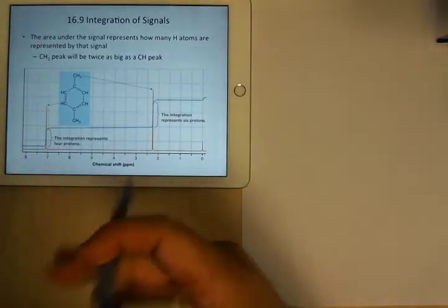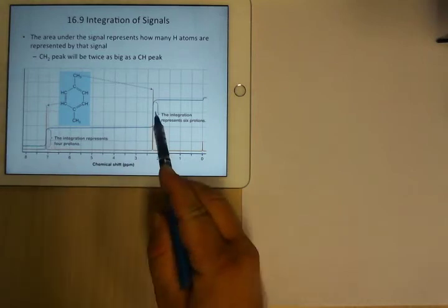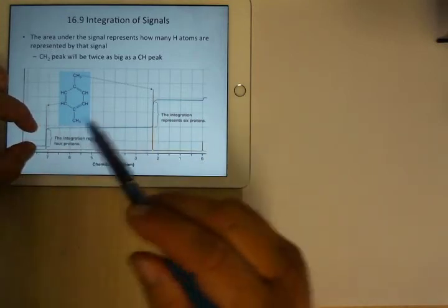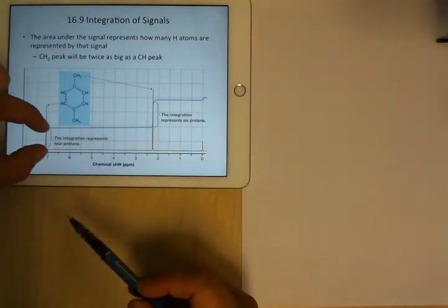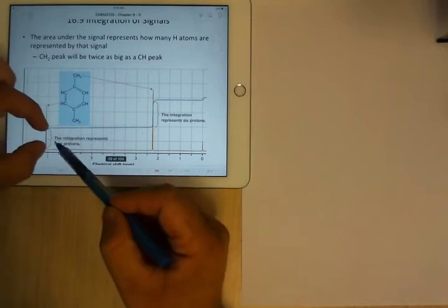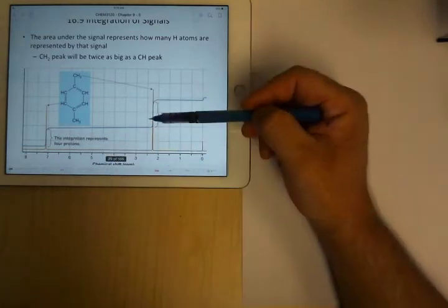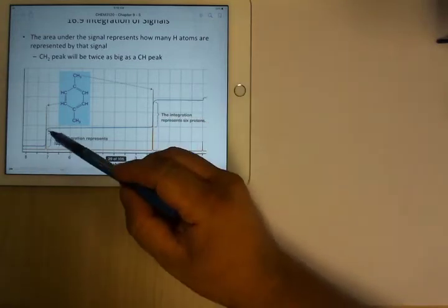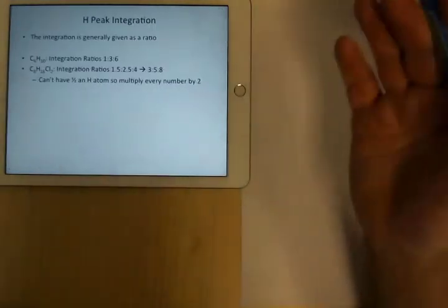Now, what you end up doing is getting a ratio. It would be 4 to 6, but really what you would see initially is 2 to 3, or 1 and 1.5. What you're looking for is this blue line here, which shows the cumulative hydrogens. You look at the ratio of the height of this blue line here to that one there. This ledge here is about 50% higher than this one, because it's 6 to 4.